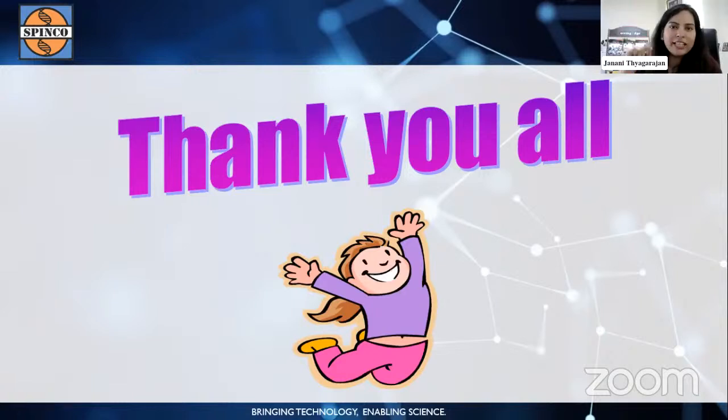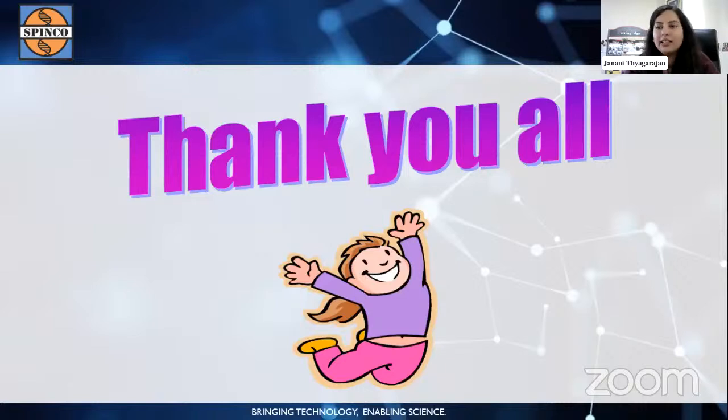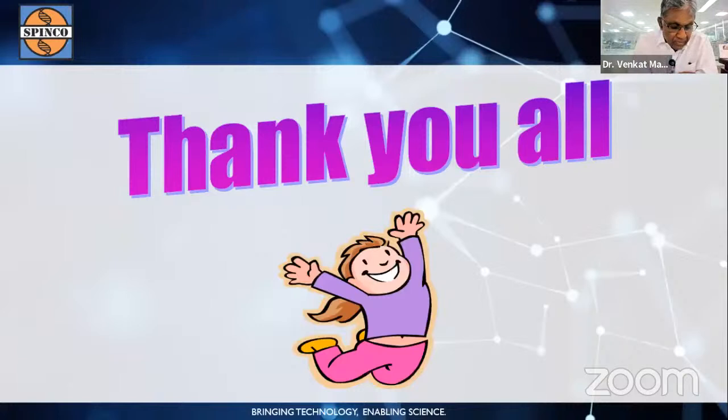Okay, I think this is from the LinkedIn poll question that we shared yesterday. One more person is asking us, kindly explain how important tuning files are for LC-MS techniques. It's very, very important. That is what gives the calibration, which is the sensitivity. Therefore, tuning is the most important information. When we talk about how to optimize a mass spectrometer, we'll talk about how to tune them. I think we have an entire session just for tuning.